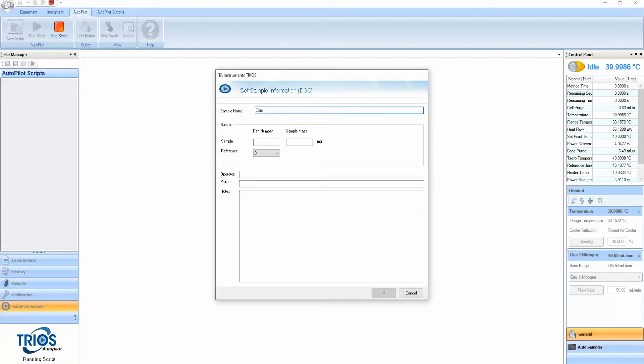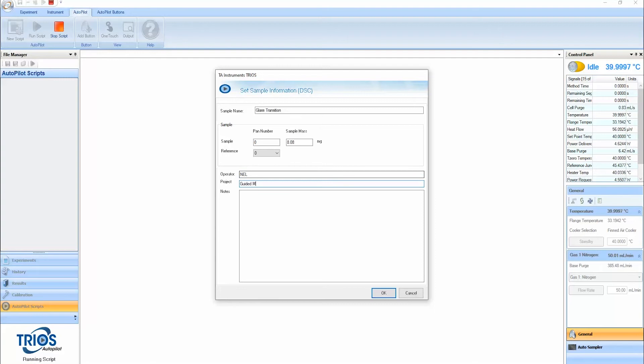Trios Guided Methods also provides an experiment template with reasonable defaults, but still allows you to customize parameters to your testing needs.